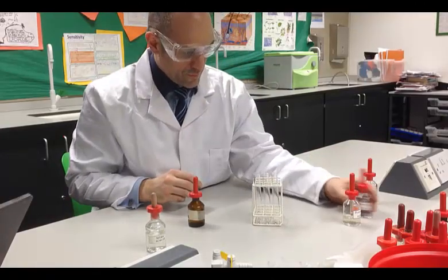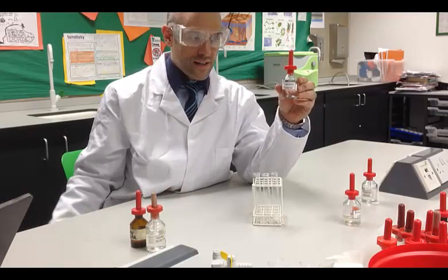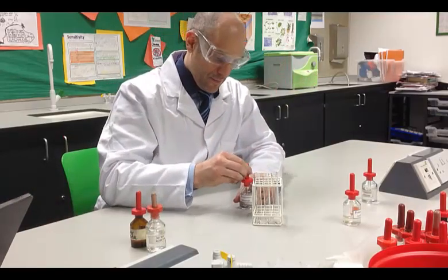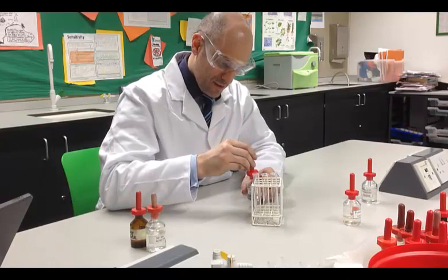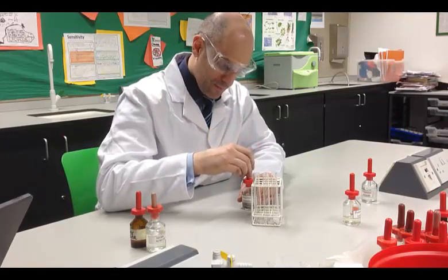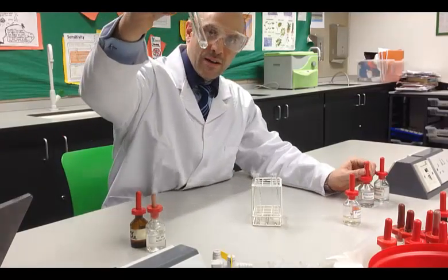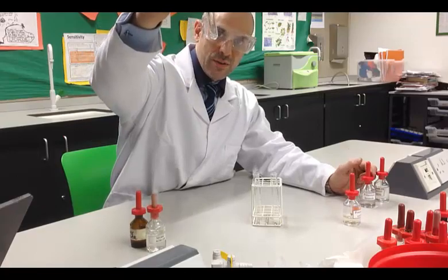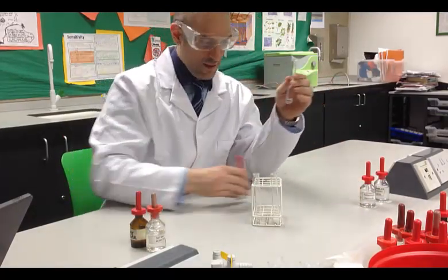Next, we're going to try it with bromide ion, so potassium bromide. Again, I will add a couple of squirts into a test tube. Okay, notice potassium bromide is a colourless, translucent solution, I should add.